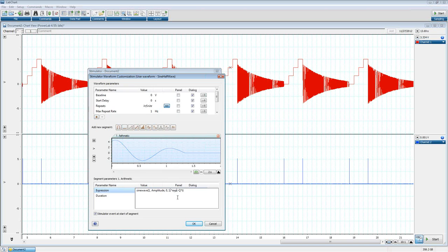So I just have this exponential, just like we would in a TI-89 or some other scientific calculator. I have a variable in here that's being operated on by time. So variables, what does that mean? How can you just type in a word here?